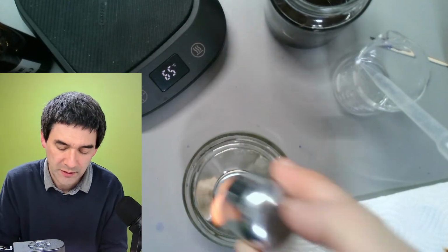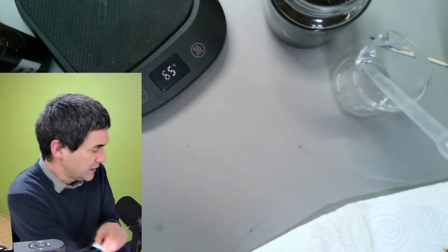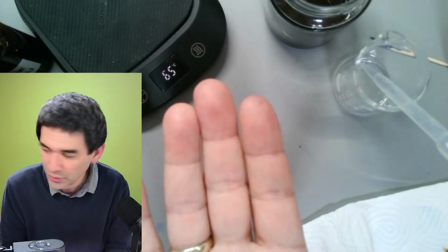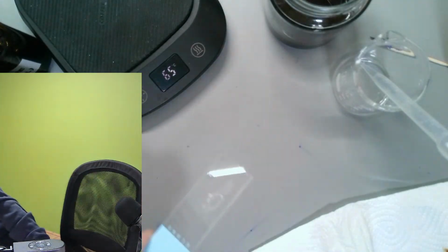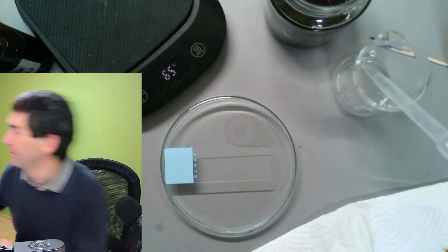So, hot enough. I'm now going to have a look under the microscope directly, okay? Let's wait again until it cools a little bit. You know what I'm going to do? Just a second. Look what I got here. Petri dish for cooling.